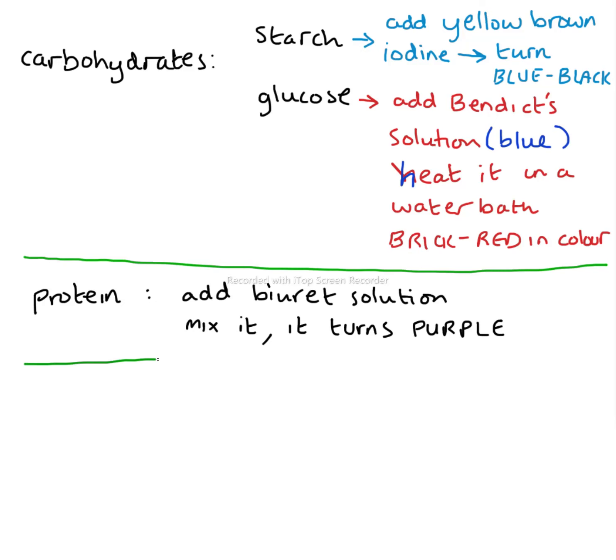Now the last one we look at is the lipid. So let's quickly get this done. Lipids or fats do not dissolve in water, so we have to dissolve it in ethanol.